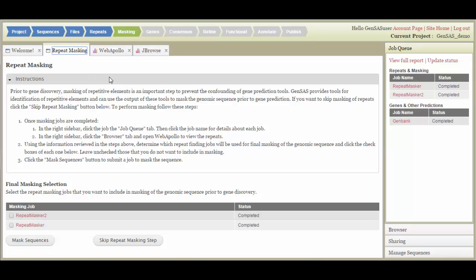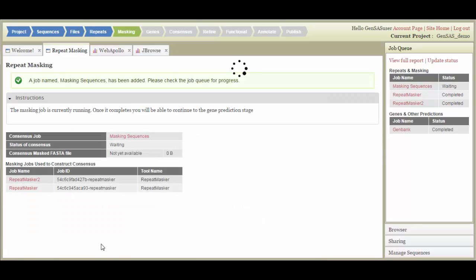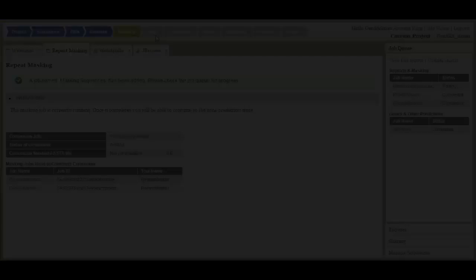On this tab, select the data sets that you wish to include, and click Mask Sequences. A Masking Sequences job then appears in the Job Queue. Once the Masked Consensus is completed, the Genes step will become available.